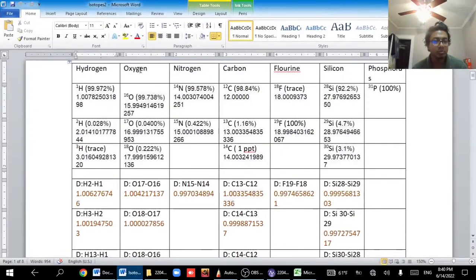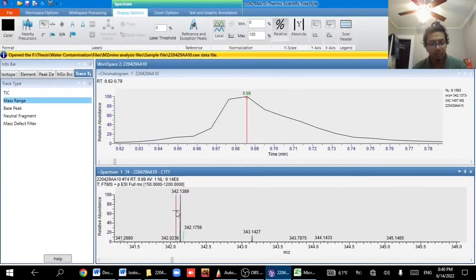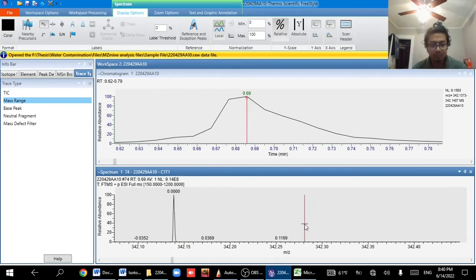What is the difference for nitrogen? For nitrogen I need to find that 0.9970 difference. So okay, then I will make it 0 again. Remember that it was 0.9970, so it is close to 1.